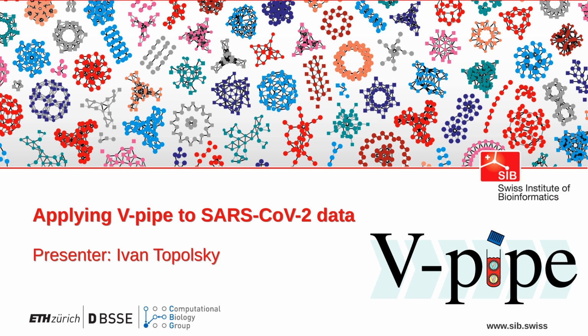I work as a software developer at the Swiss Institute of Bioinformatics, and in this poster presentation, I'm going to show the work that has been done in our computational biology group at ETH Zurich on VPipe, our viral genomics pipeline, as we are currently applying it to SARS-CoV-2.